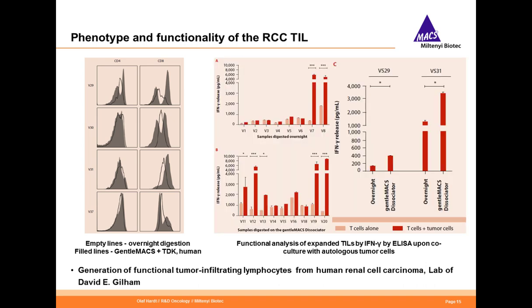And moreover, also because of the very gentle dissociation procedure, you see that the functionality of the cells is actually significantly improved. By co-culturing the isolated TILs with autologous tumor cells from these patients, you see that here by readout interferon gamma release by these co-cultures, the T-cell activation is much better with our procedure than with the classical overnight digest.